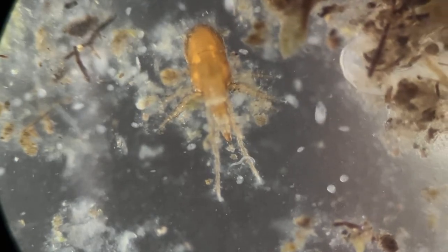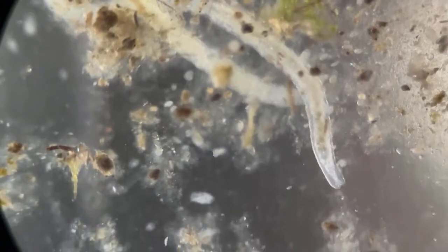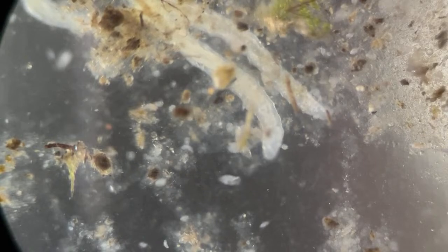The worm has started moving again, this bigger worm. I'm just waiting for it to straighten its body so that we can get a better view. There is adequate water there.